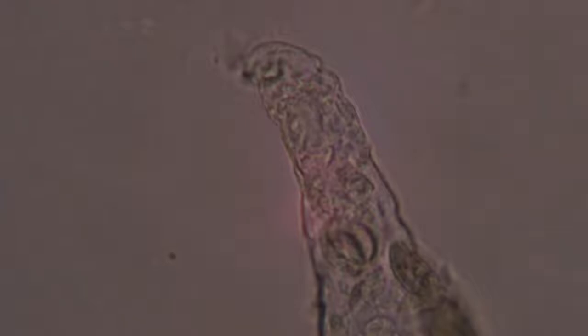Oh, that's a bacterium swimming around, I think. Pretty sure that's a little bacterium swimming around it, just from the shape of it. Those are just little flagellates, very small. At first it looked like a little zigzaggy shape, like a spirilla, other kinds of bacteria that are kind of a spiral shape and swim around in funny patterns. So it's a pretty good shot of a rotifer, it's just unfortunately not alive anymore.